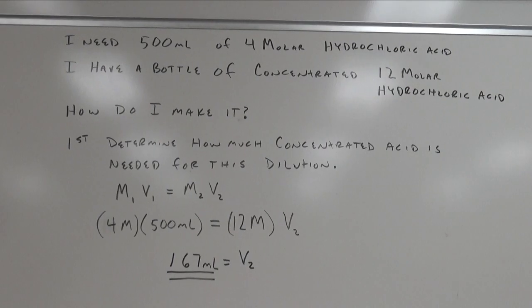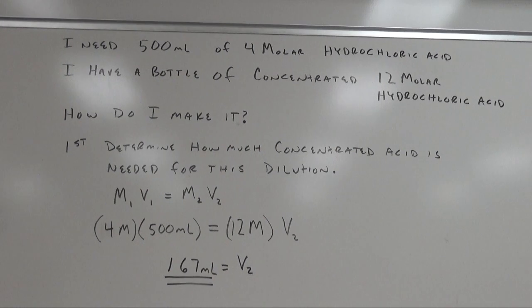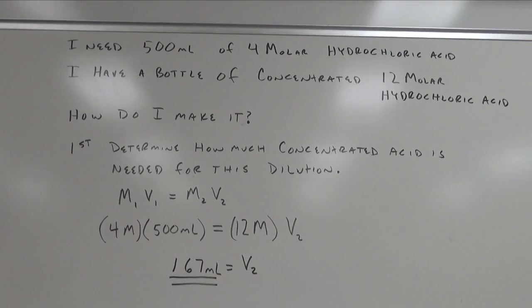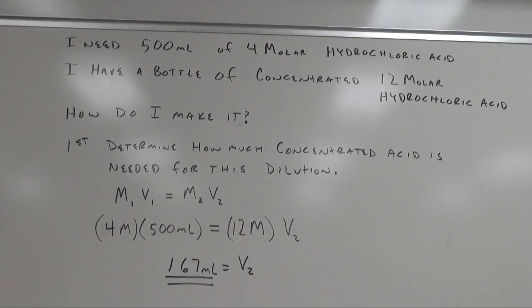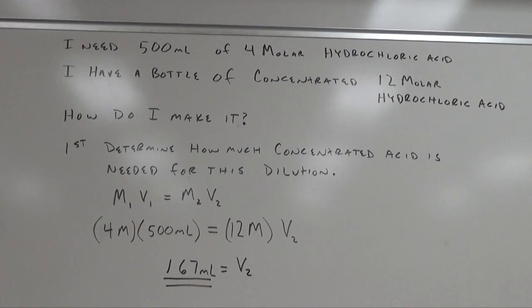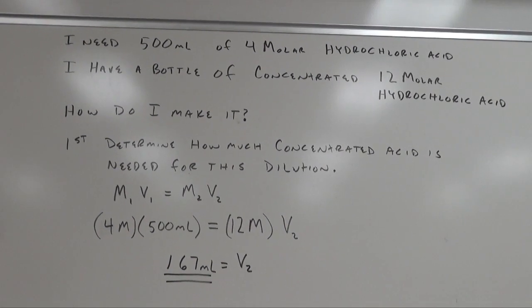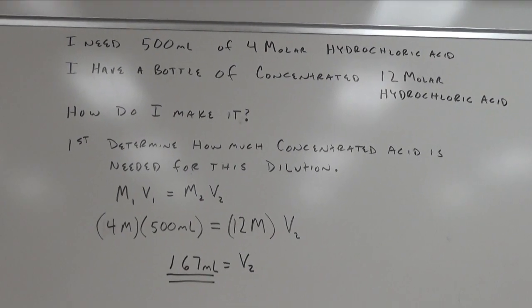For today's lab, we're going to need to make a diluted acid solution of hydrochloric acid. To do this, I need to calculate and then make the solution. It says I need about 500 milliliters of 4 molar hydrochloric acid. The only problem is what we have in the stockroom is a bottle of concentrated hydrochloric acid, which is 12 molar. So how do you go about making this?